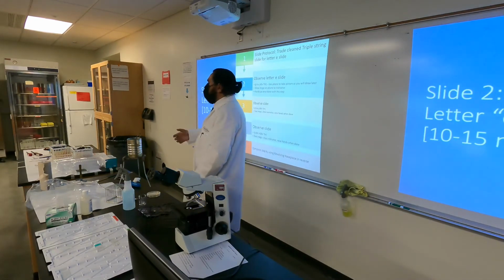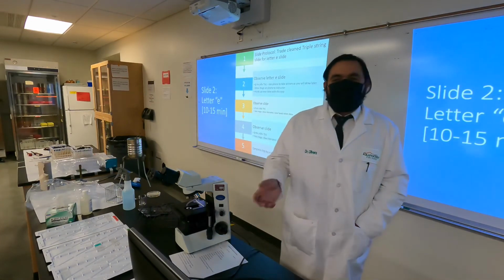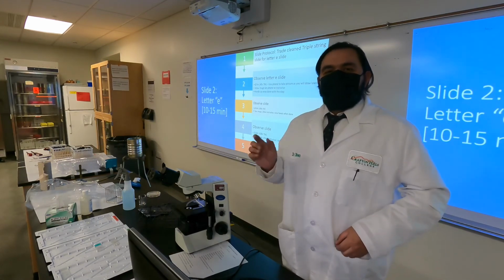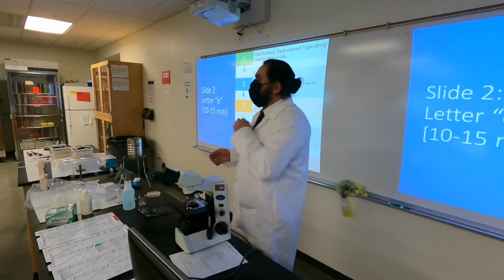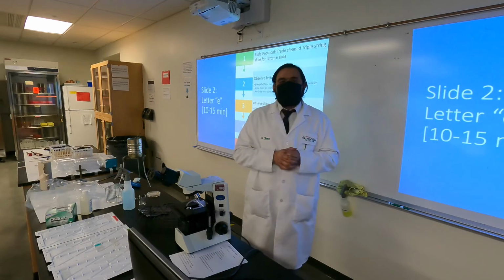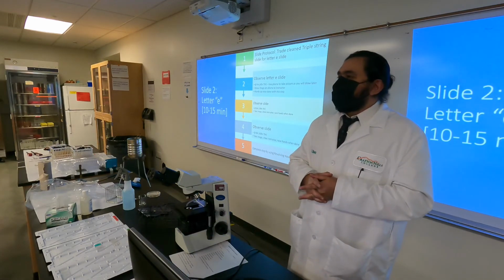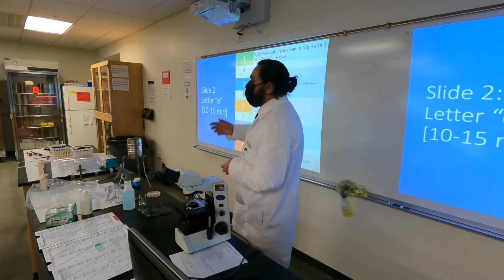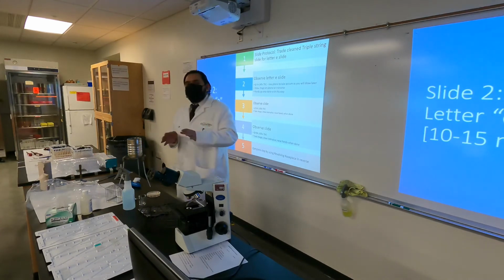Now, do me a favor, again, as usual, raise your hand so I know that we're moving on from the first step to the next step. Once you make it to your letter E and you get the first picture, we're gonna start, or complete, sorry, our plate pouring portion, okay? So I wanna see hands once you found your letter E, and then we're gonna move on to the next step. So get your second slide, raise it all the way up so you can find letter E, good to go. And once we're there, leave it alone for a second.